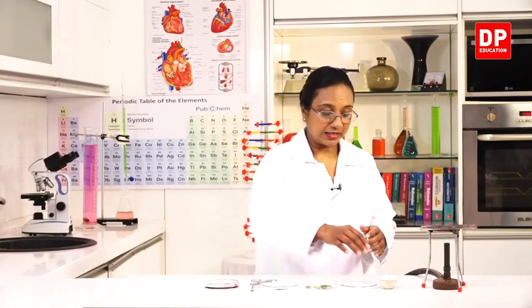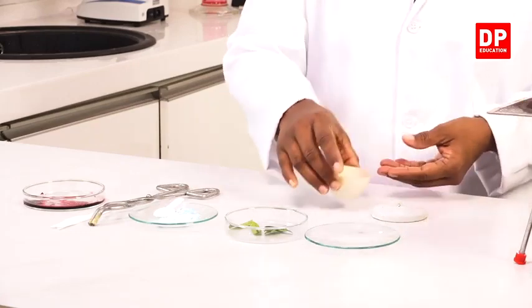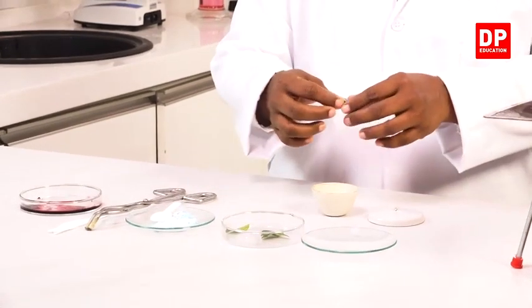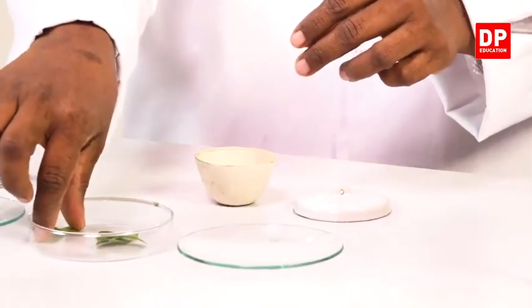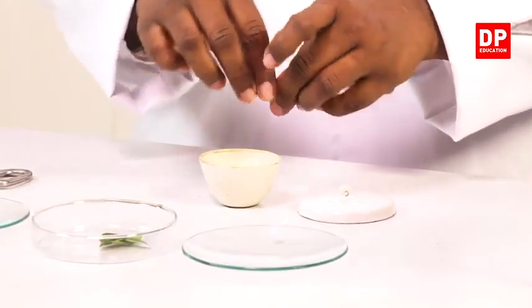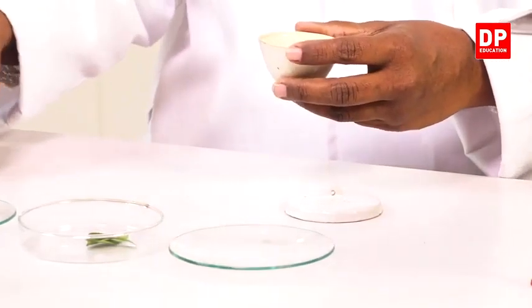Now, to start the activity, I will take the crucible. Then, into the crucible, I will put a few pieces of the leaf. If we break it into pieces, it will become hot quickly.